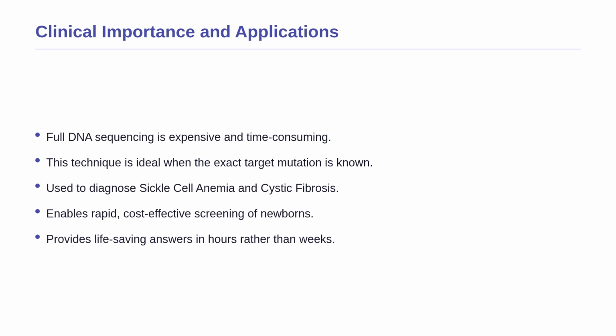Understanding how strict this binding is, you might be wondering why we need such a specific tool when we have modern DNA sequencing machines available today. The reality is that sequencing an entire gene is often expensive, time-consuming, and completely unnecessary when we already know exactly which mutation we are looking for.